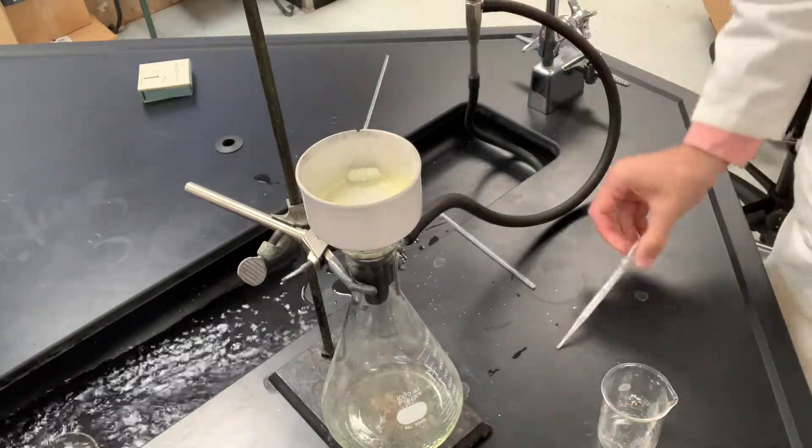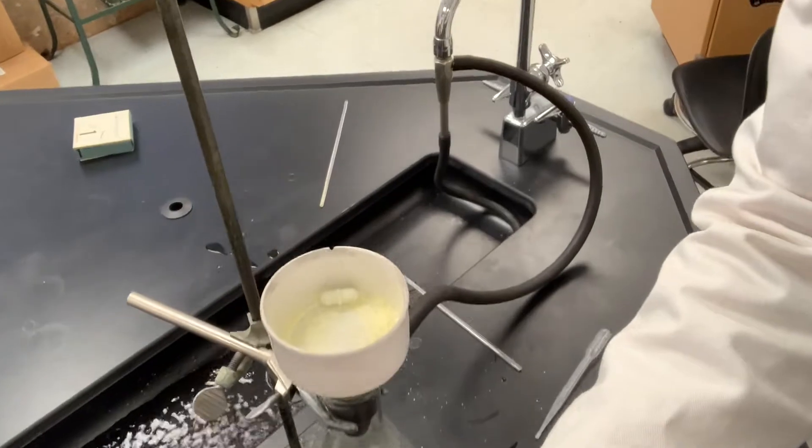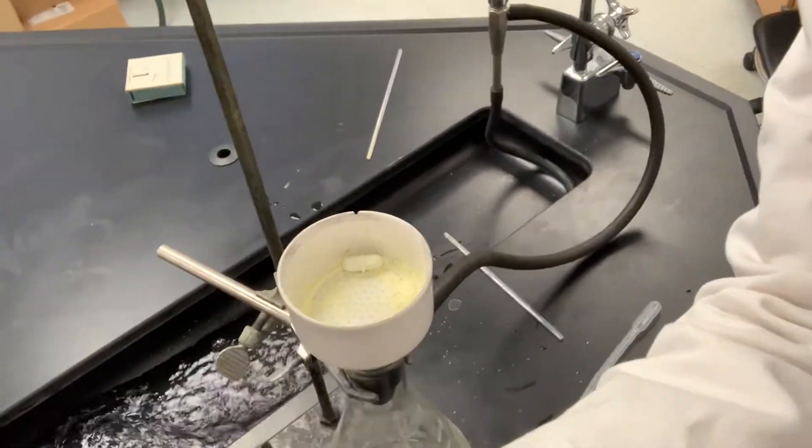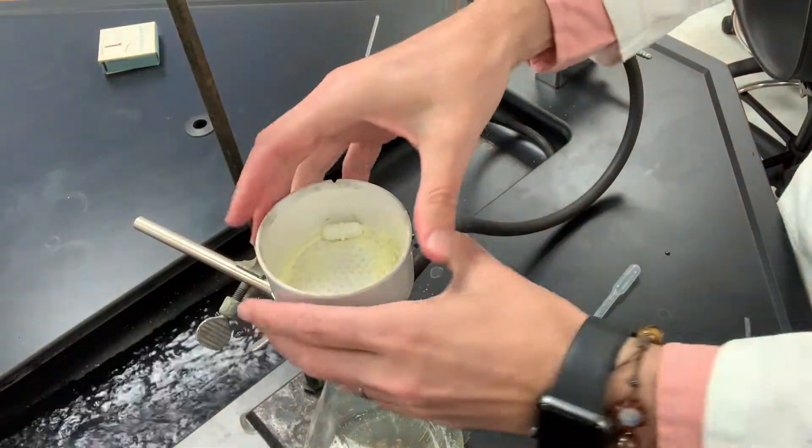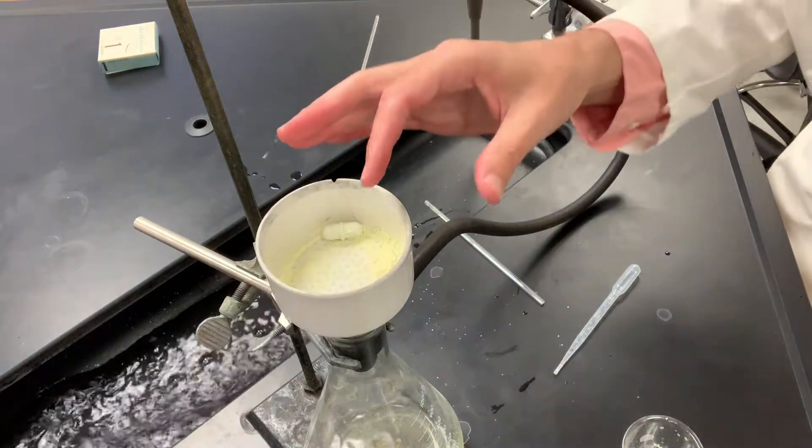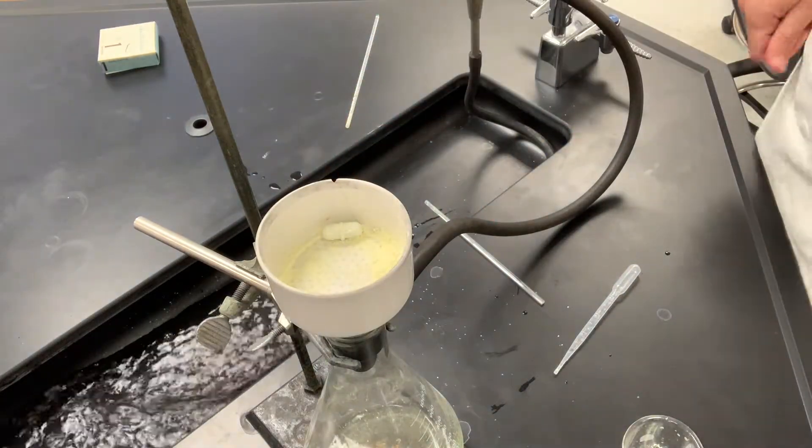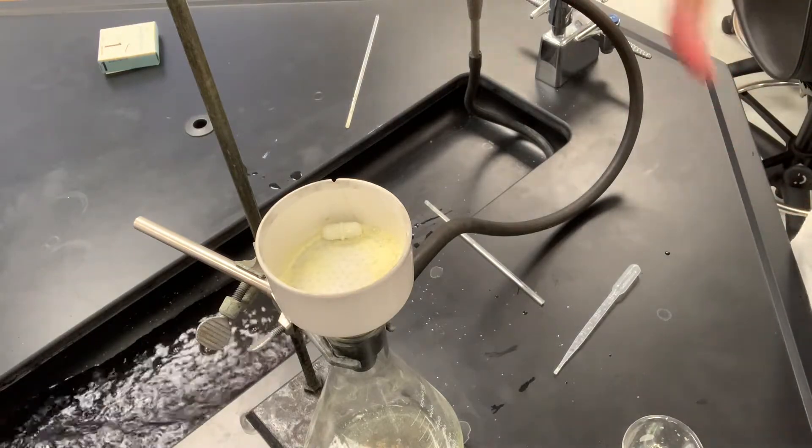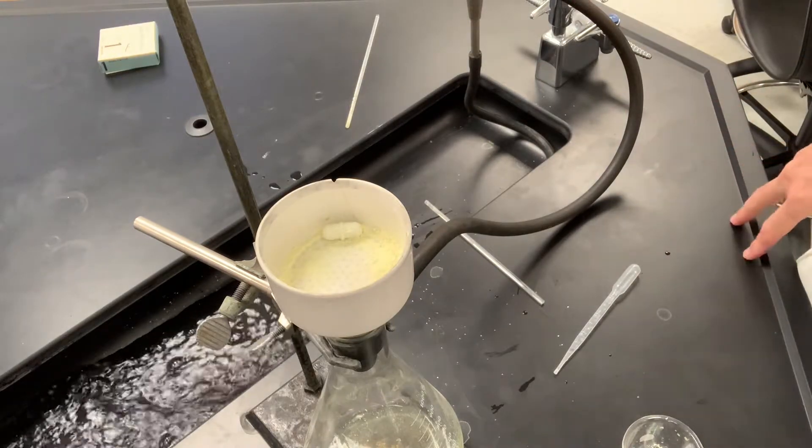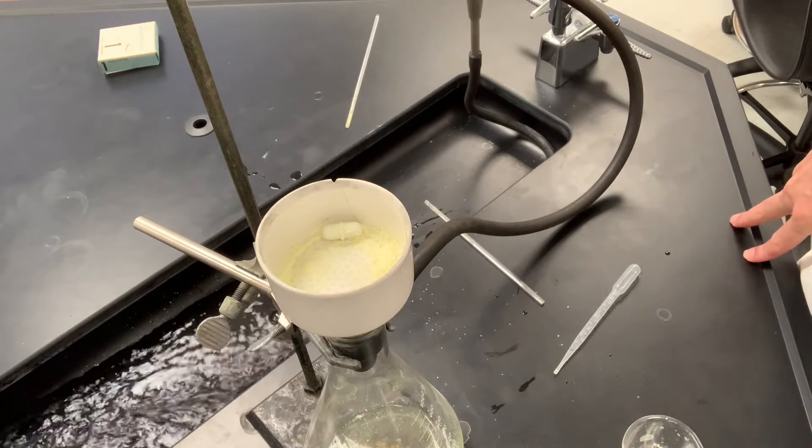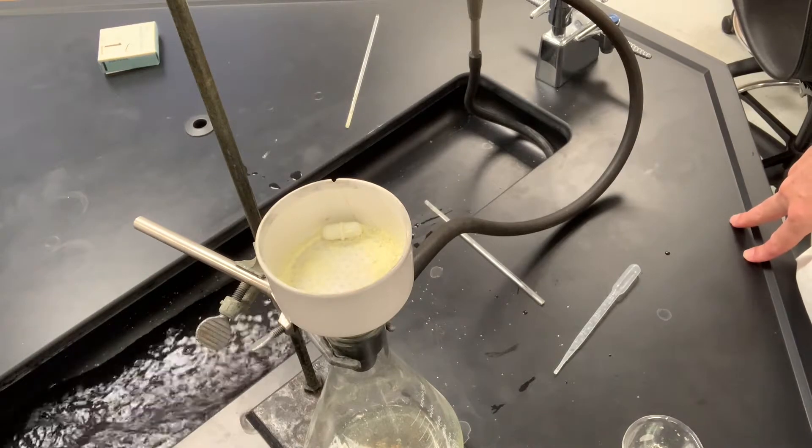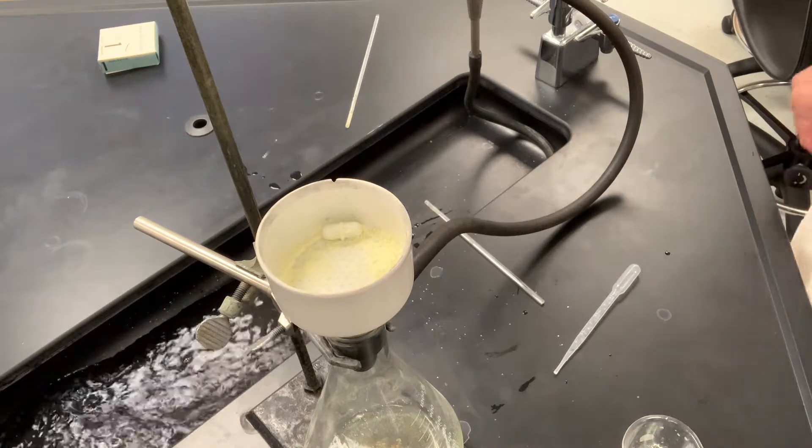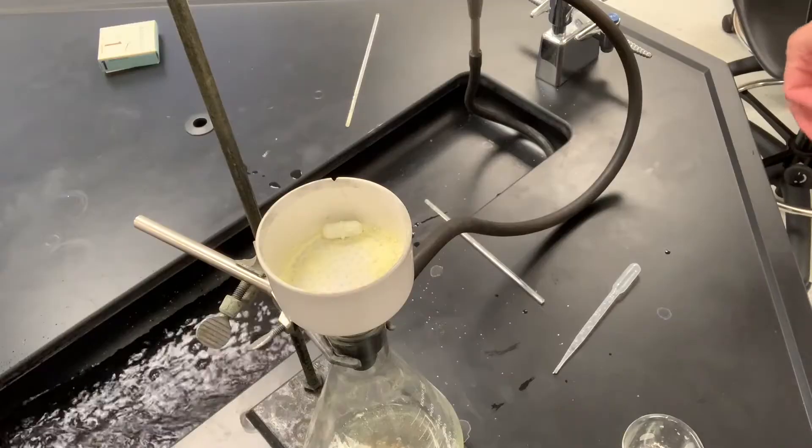So that might be around 10 or 15 milliliters. Let me try to position the camera here so you can take a look at the solid. It's got a kind of yellowish tint to it, so we'll let this air dry here maybe about five minutes, and then we'll set it out to just air dry until the next laboratory period. Then we'll go ahead and weigh it when it's dry to calculate the yield.